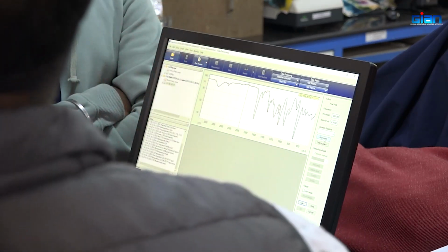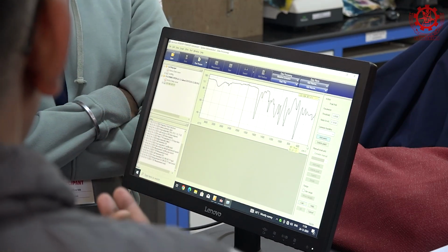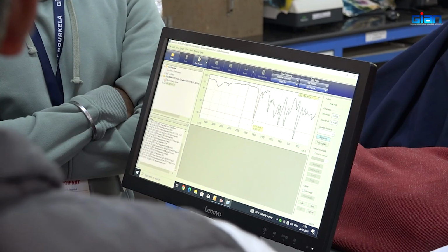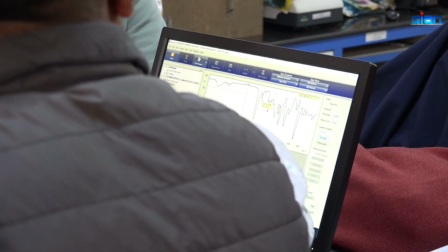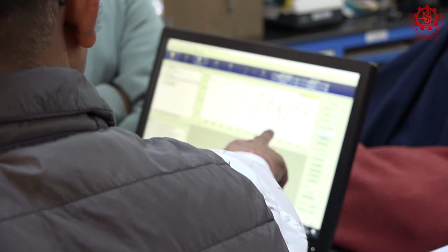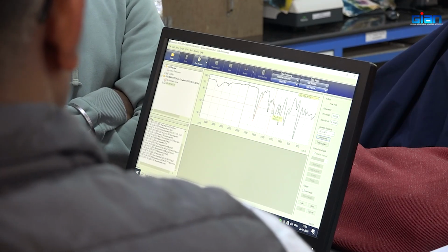Now you need to learn what this IR spectroscopy is, which part of your molecule will give a peak in what region, and so on. Then you can analyze the spectrum. For example, you may not know, but there is a peak at around 1600, maybe 1700 something. Okay, now he will do the peak picking. I think it's just a right click or something.